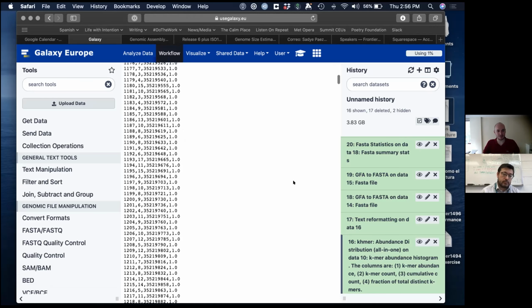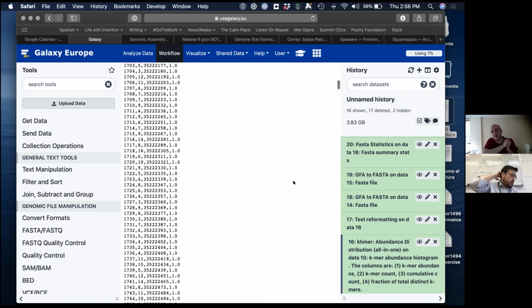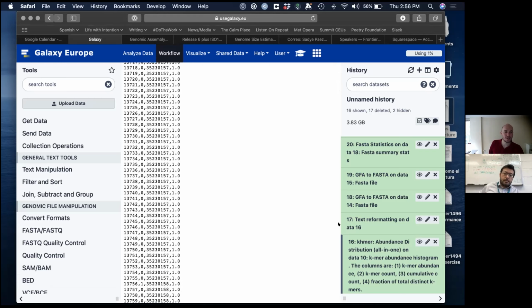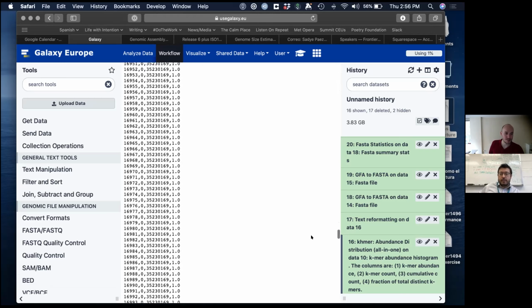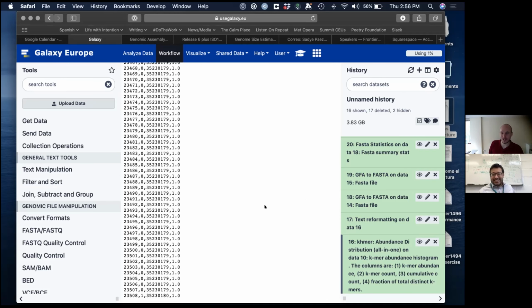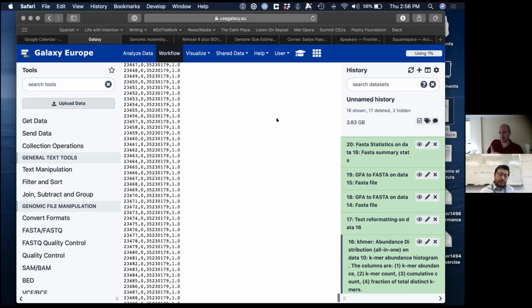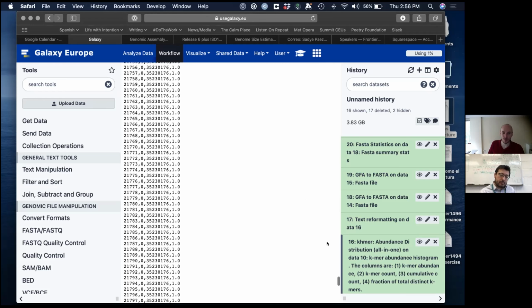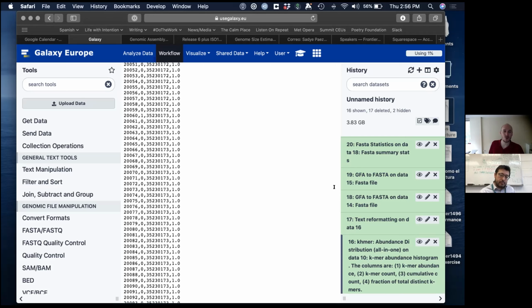You see, very few copies, but this table is massive. It goes on and on for hundreds of thousands of lines. That's just E. coli, a simple case. Yes, it's a very simple genome, about 5 million base pairs, but the genome that I showed before, which was actually relatively small, is 100 times that size. And of course this is going to go on and on.